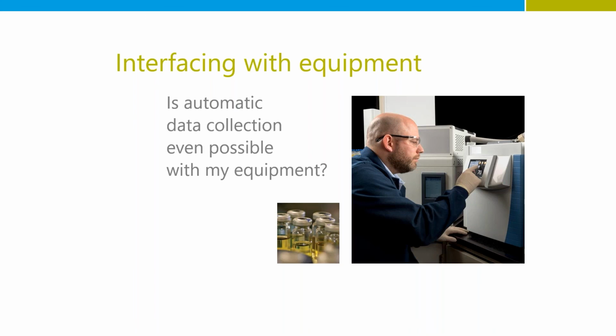interface, so the equipment might be connected up to a running PC machine. When the data arrives in there, it might have the ability to use something like an API or application interface to then send the data to another location to continue the processing.